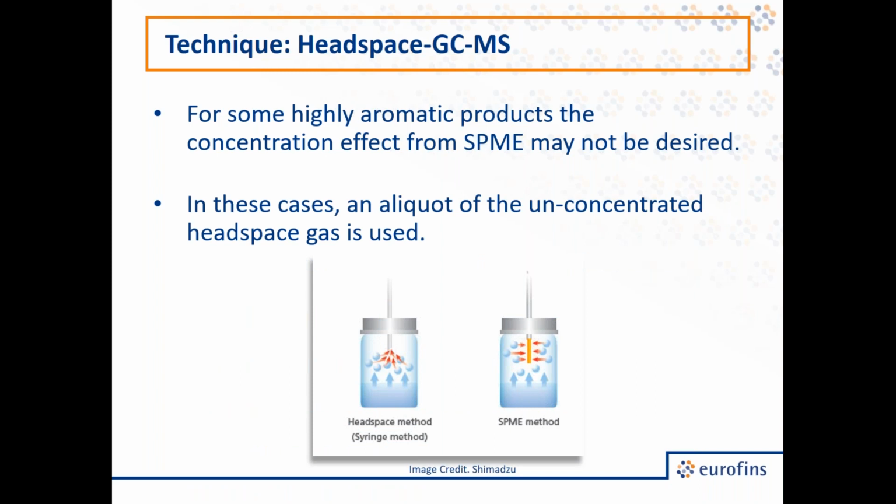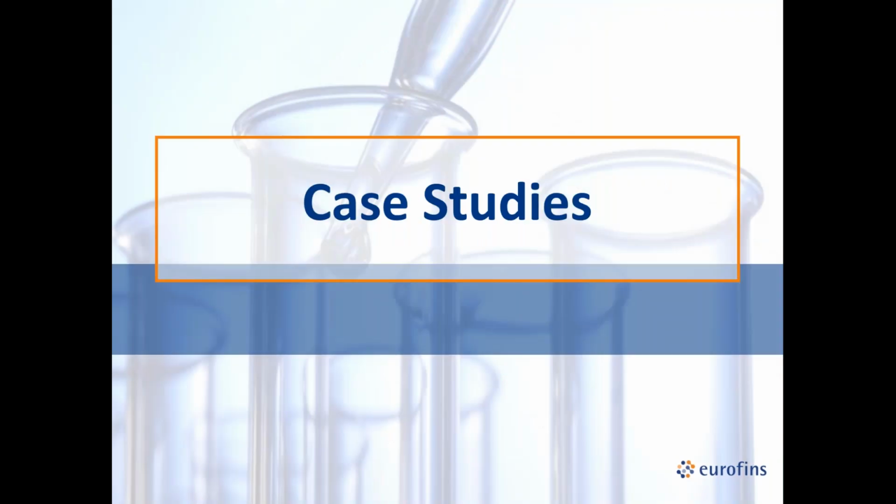Related, there are other approaches we can take as well if needed, such as solvent extraction and direct injection for less volatile compounds. So that was just a brief overview of off-odors in GCMS, and I'm going to turn you over to Lily for some case studies.